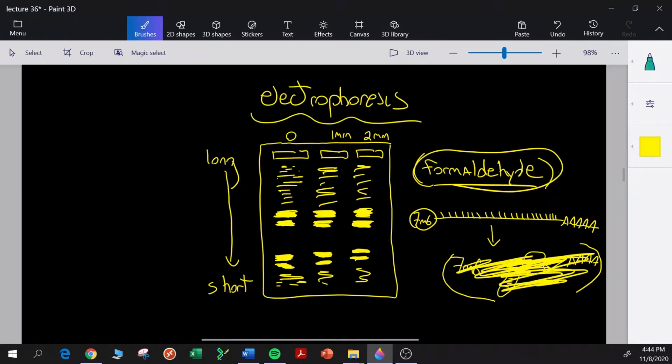And so what would these be? We talked about the ribosomal RNAs quite a bit in this course and in BSc 219. So this is going to be the 28S. Then we'll have the 18S ribosomal RNA, S being Svedberg, and then 5.8 and 5 down there. So we might be able to see these. But we won't be able to see really individual messenger RNAs because the levels just aren't high enough.